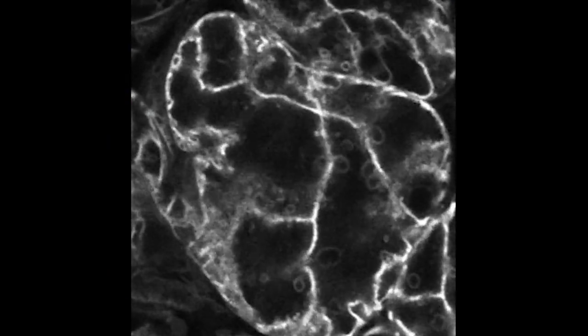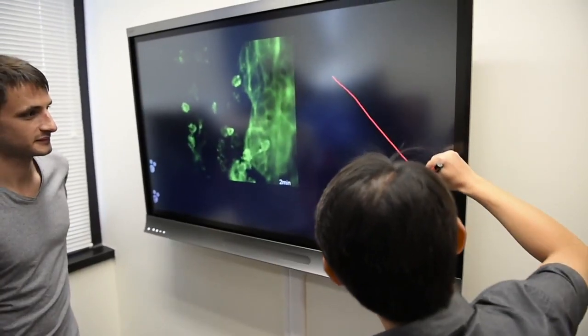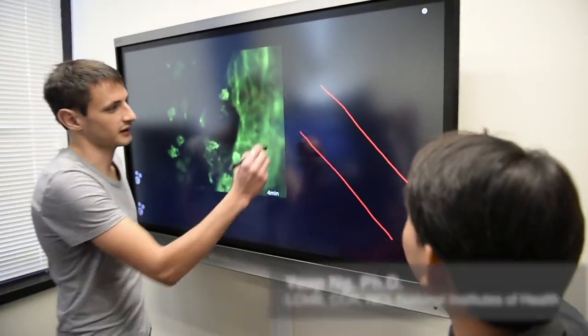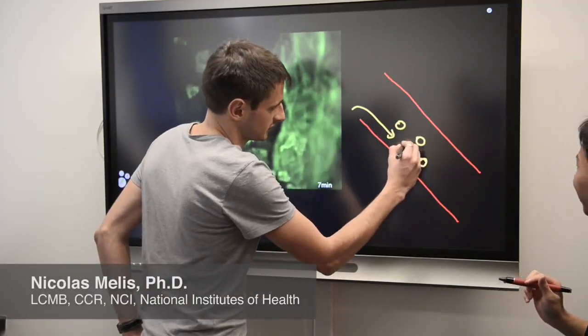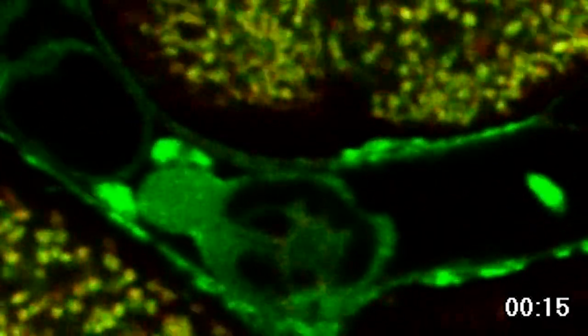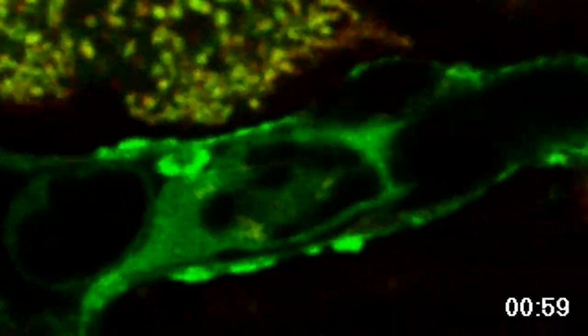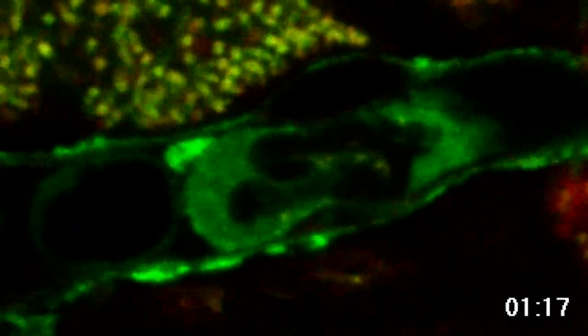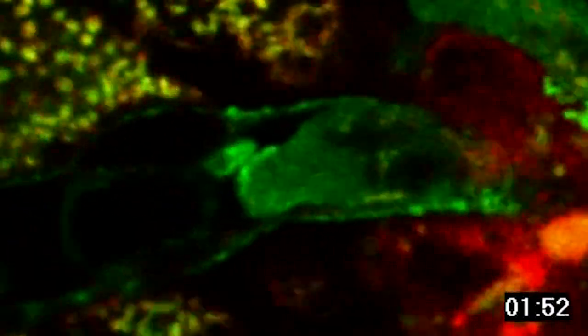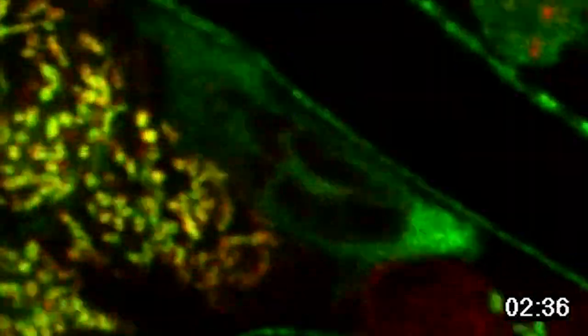But in mice engineered to not express myosin-2, the integration is stopped. Is this contractile machinery also used in other physiological or pathological processes? We are beginning to investigate this question. For example, during cell motility. This is an immune cell that is moving inside a blood vessel in breast tissue. The green fluorescent is again myosin-2 that is recruited in different areas of the plasma membrane to drive this complex motion through contractions.